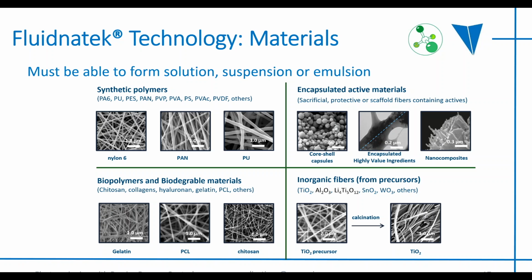And then inorganic fibers is another important aspect for some applications, such as those that would be materials for use in high temperature applications. We typically see titania, silica, alumina, zirconia fibers, and these are processed through a sol-gel type process. So we spin fibers from a sol-gel, and then they undergo a heat treatment to burn away all the organic fraction and leave the pure inorganic fibers.